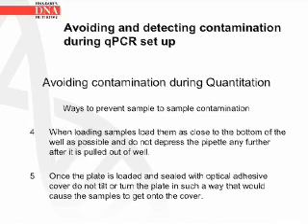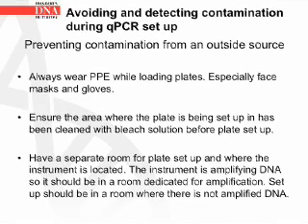Once the plate is loaded and sealed with the optical adhesive cover, do not tilt or turn the plate in such a way that would cause the samples to get onto the cover. Now let's go over some ways to prevent contamination from an outside source.